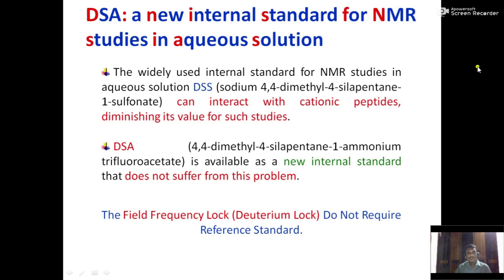Also, I have mentioned, you can skip any internal reference, and simply use the field frequency lock. I have told you about the field frequency lock, the deuterium lock, and if you are using it, then there is no need to use any internal or external reference standard. The field frequency lock itself works as a reference.